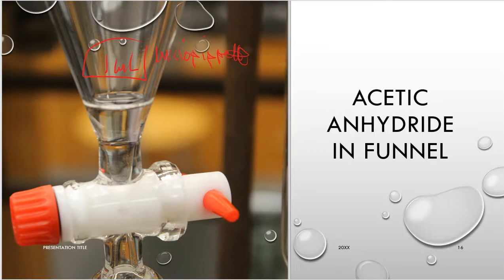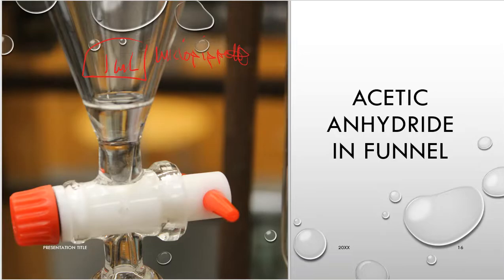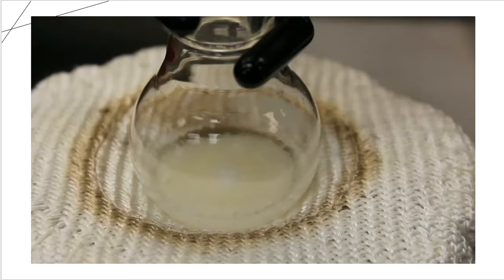The reason that it tells me to add it in small portions is that this reaction, when all of these go down into the jacuzzi tub, they are going to go hubba, hubba, hubba, hubba with each other. And when they do that, a lot of heat is going to be generated. And I don't want to do this all at one time. I want to go slow, and I want to be safe. So here is the next step of the laboratory procedure.